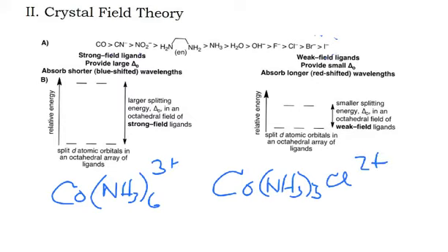And what we saw with these compounds is that the hexamine compound was orange, meaning it absorbs in the blue region of the spectrum, about 450 to 500 nanometers wavelength. The rose compound absorbed at longer wavelengths in the yellow to green part of the spectrum, which would be lower in energy, which corresponds to the patterns that we see here.